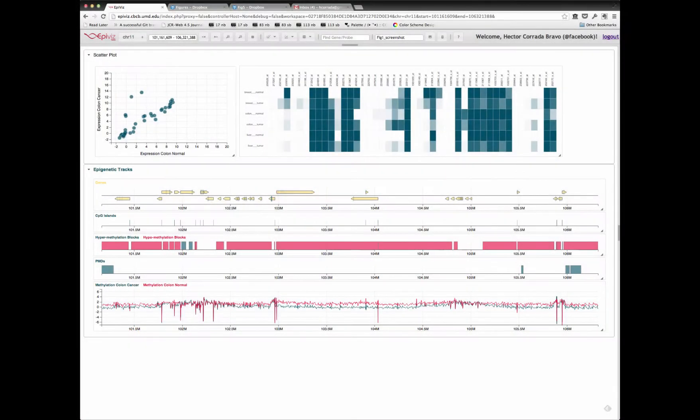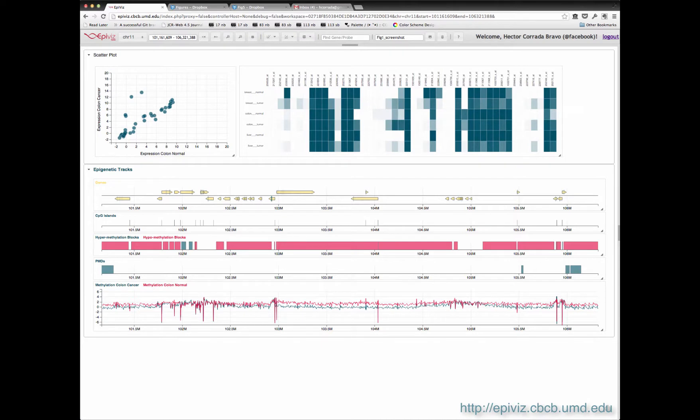This is a quick tour of EpiViz, an interactive visualization tool for functional genomics.